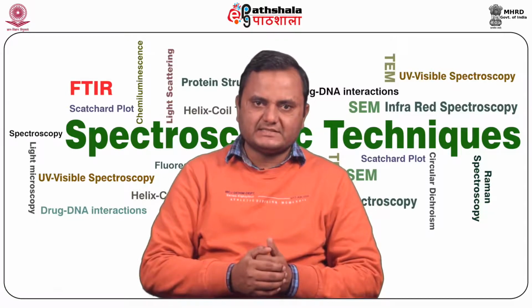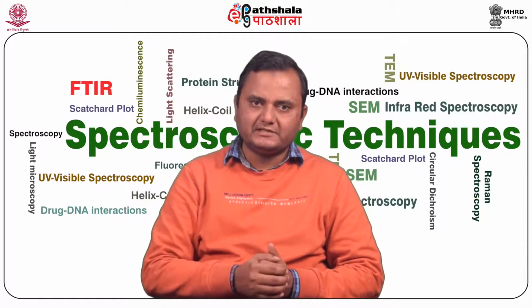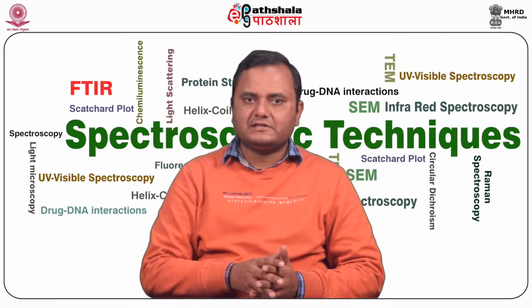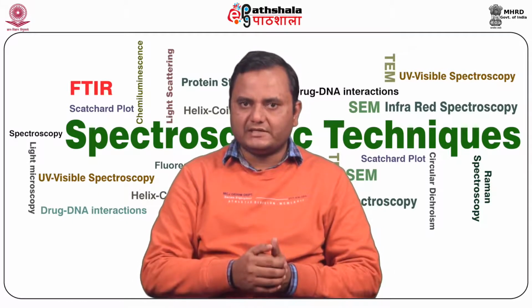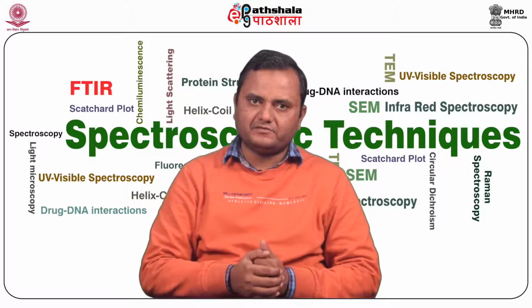In general, the CD signal at 215 nanometer indicates the beta sheet content, and the CD signals at 208 and 222 nanometer are used to estimate the alpha helical content of a protein.